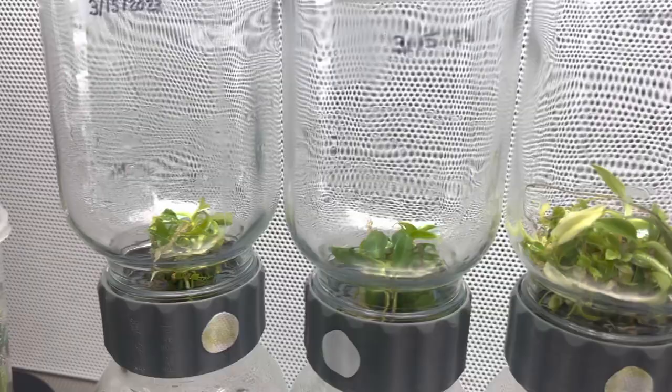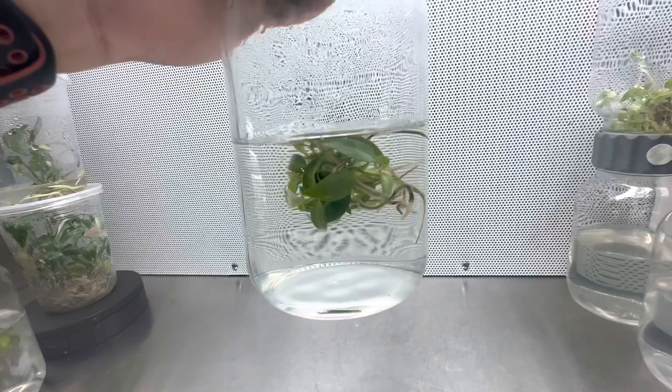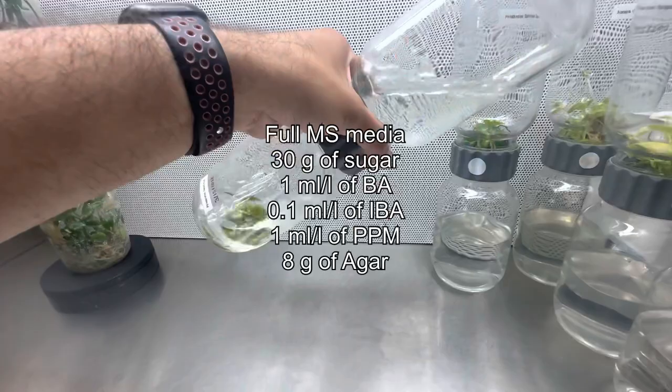Just look at how amazing these plants look on solid or liquid media. I have seen a lot of people using and recommending the same media I used in the past, so I feel like it is my responsibility to let you know that I have changed the media and I am getting much better results.